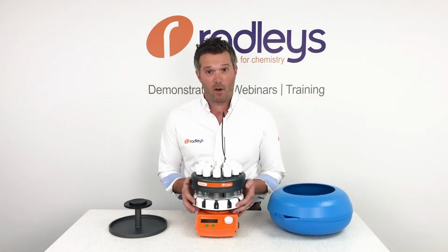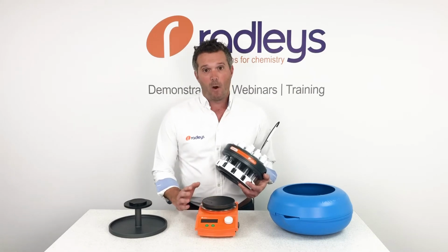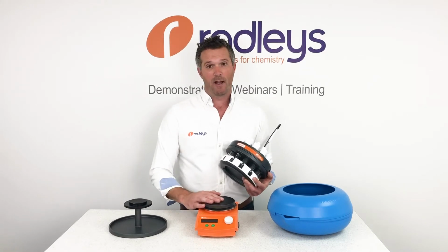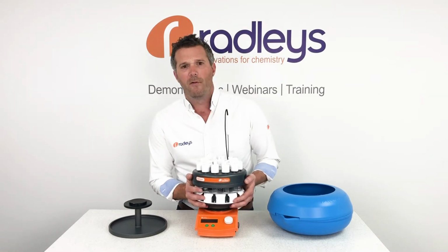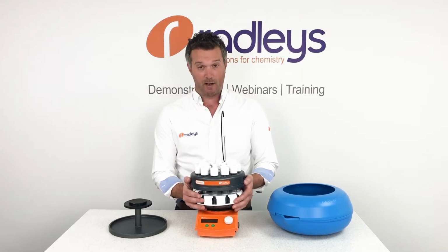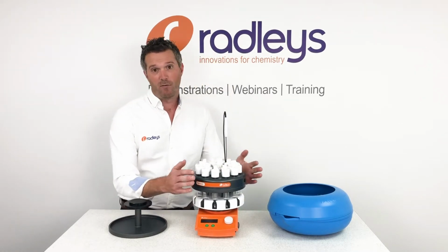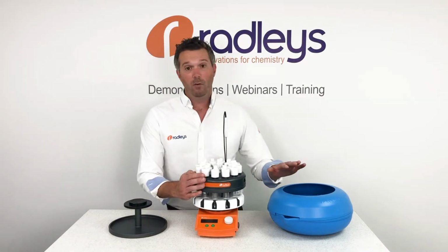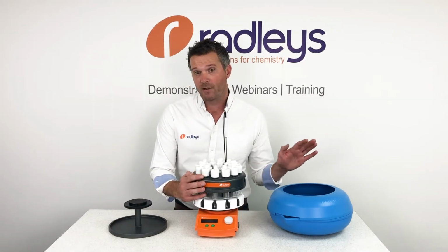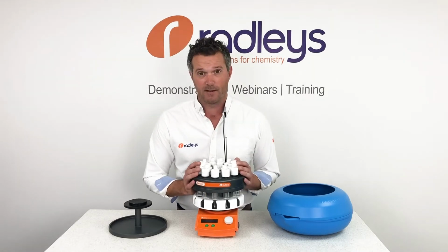So the Carousel sits on a standard 135mm hot plate, and the hot plate provides magnetic stirring as well as heating if needed. All of the reactions can be easily put under an inert atmosphere, and refluxing is possible through the reflux head at the top. We also have a Carousel cooled version for cold reactions, which I'll show you later. So let's look at the features individually.